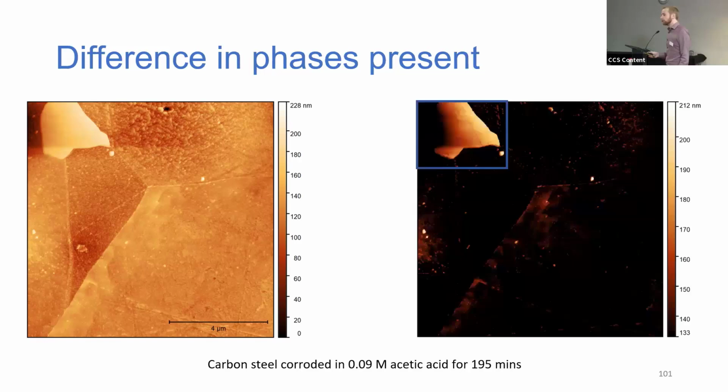By changing the contrast on the image or adjusting the Z scale to highlight this section, we can see that it remains relatively flat, whilst also containing what appears to be polishing marks left over from the sample prep.